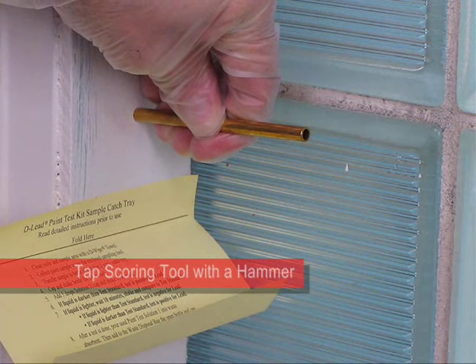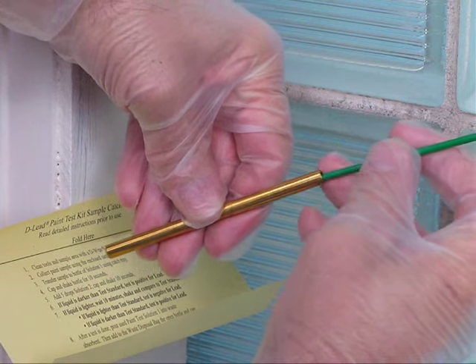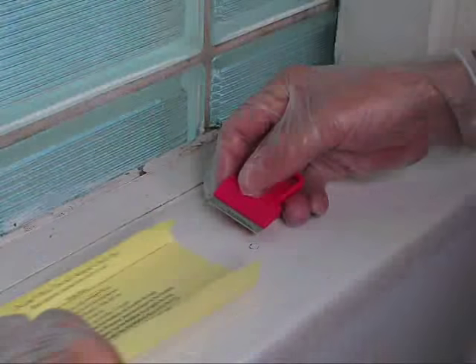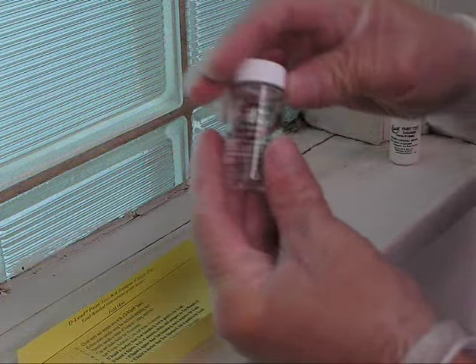An alternate scoring method is to tap the scoring tool with a hammer. If any of the sample remains in the scoring tool, use the cleaning rod to push it out onto the catch tray. When testing horizontal surfaces, use the same sampling method. Use the sample catch tray as a dust pan to collect all the paint chips.